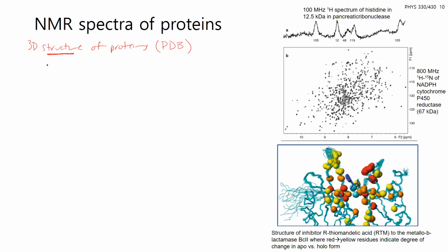And the first time of measuring a protein by NMR wasn't long after the discovery of NMR. If you remember, last time we talked about NMR being in the 1940s; in 1957, 1D proton NMR was used to look at ribonuclease.